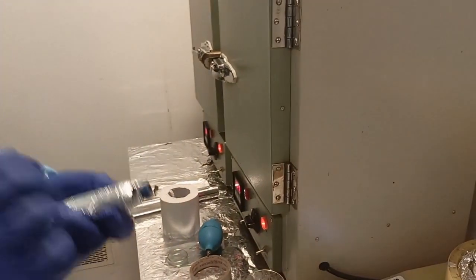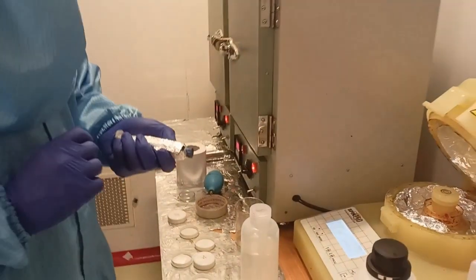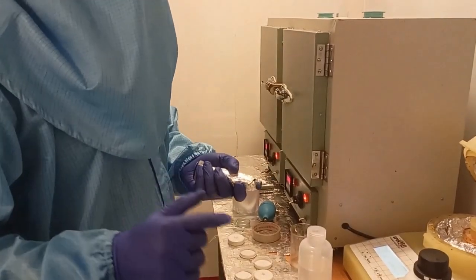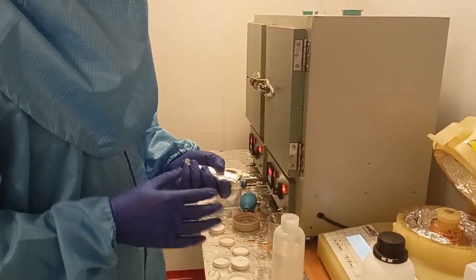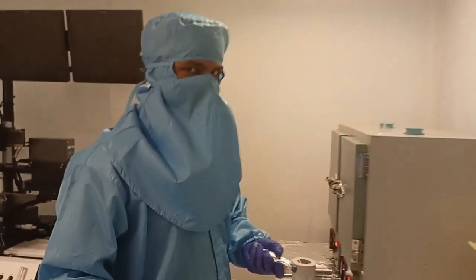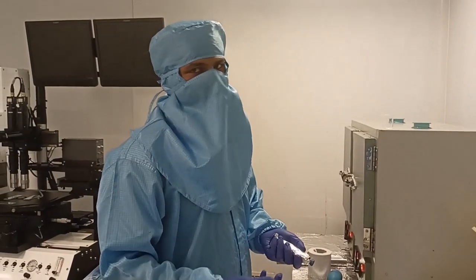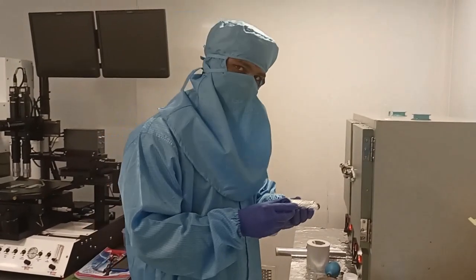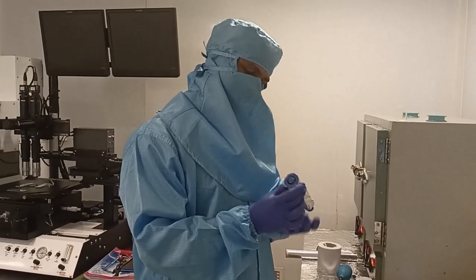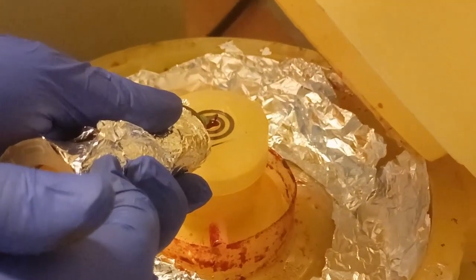So what is this? This is our photosensitive material, which we call photoresist. What is the company? Its commercial name is AZ-4562. When exposed to light, especially UV light, this becomes an indene carboxylic acid. For developing, we'll come to the development later. Is it a positive or a negative photoresist? It is a positive photoresist. And we also have to make sure that bubbles don't form.